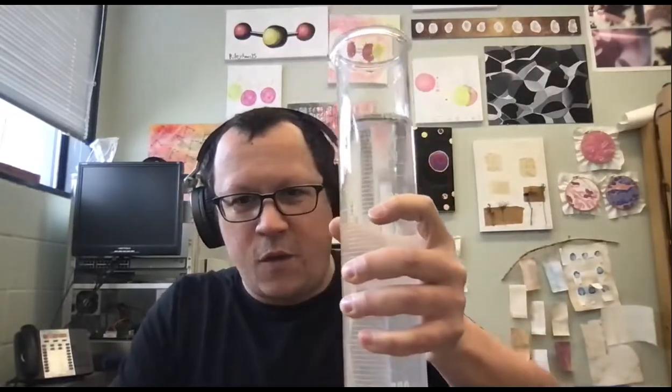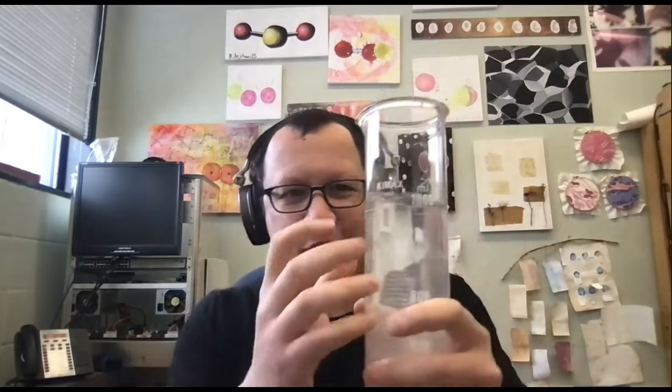But if you've had chemistry, you should know that this is now actually not a 1 molar solution. I'm sorry, I know that's very confusing. If you look at what happened here, when we added that mass into this 1 liter, it took up some volume. So if we look at that measurement point, our liquid volume is now above it. The right way to make a solution is to measure out a volume smaller than what you want, pour in your dry stuff, get that dissolved, and then bring your volume up.